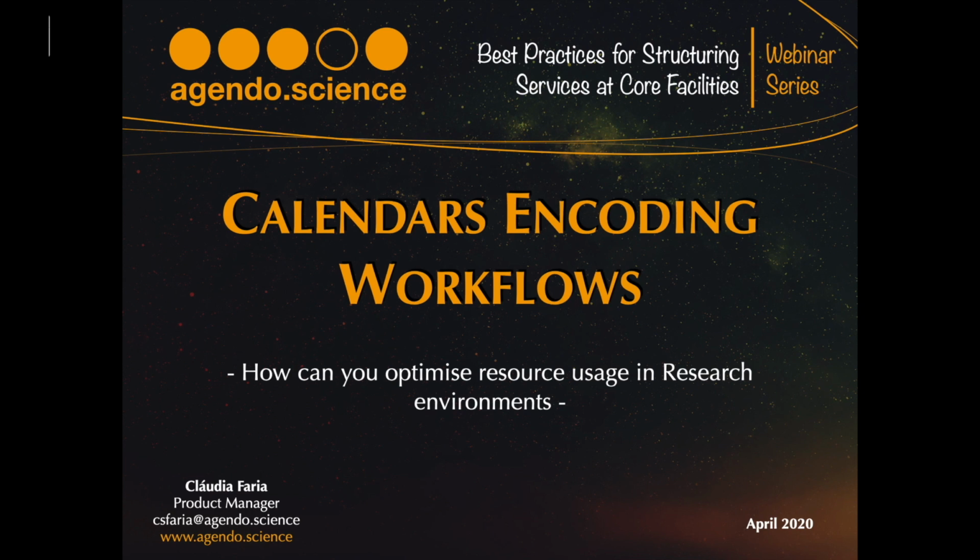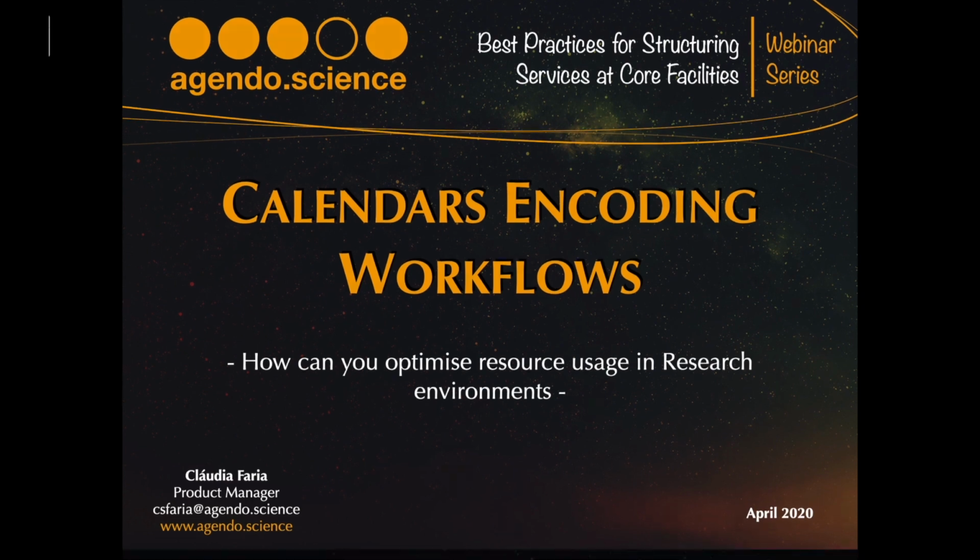In this webinar, we'll be discussing how calendars can encode workflows and how to make the best approaches to optimize time and resource usage.